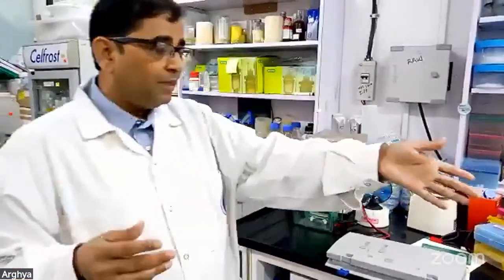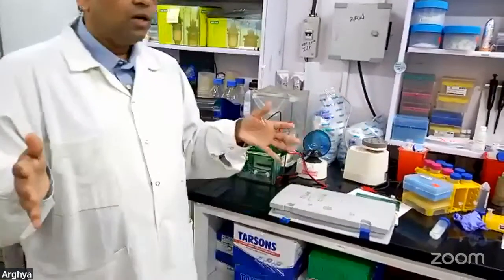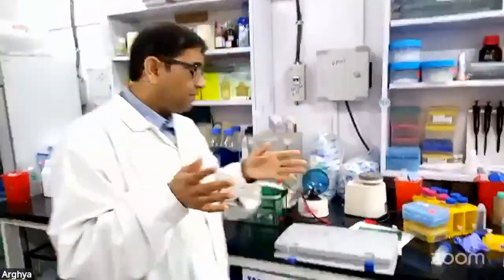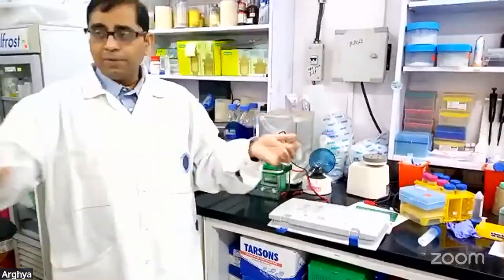We can separate those on the PROTEAN or one of the Ruby setups, which you can bring in here and we can show. So we can do those separations on the large units as well. Again, it depends on what our IPG strip length is. If the length is 7 centimeters, this gel is good enough. If the IPG strip length, as I mentioned to you, is very large, it could be 24 centimeters.